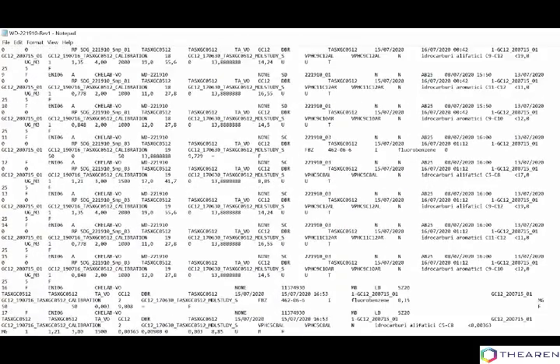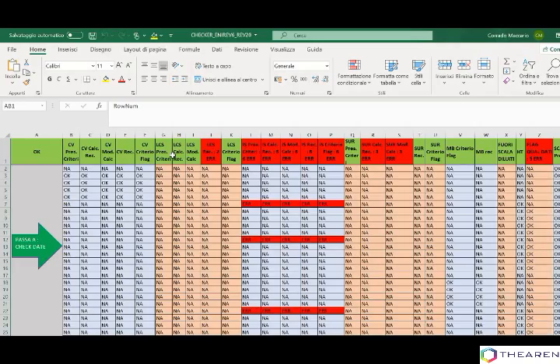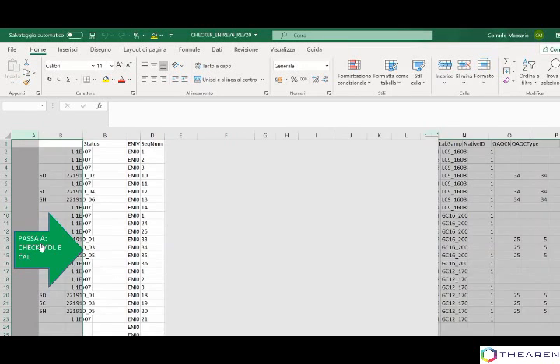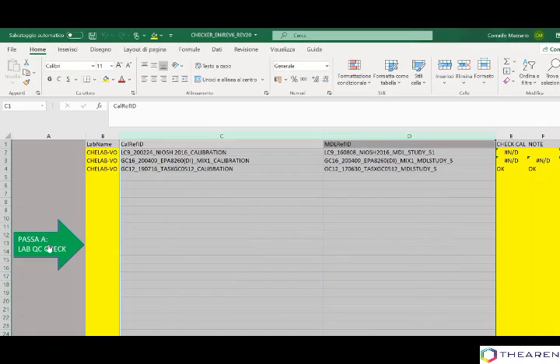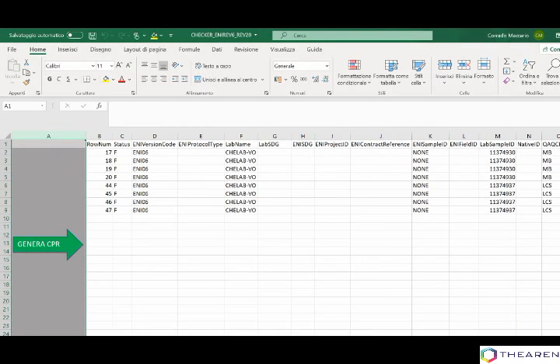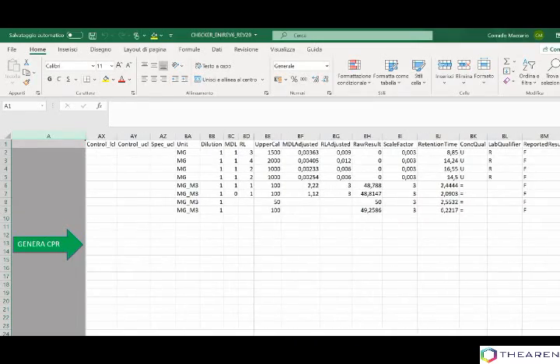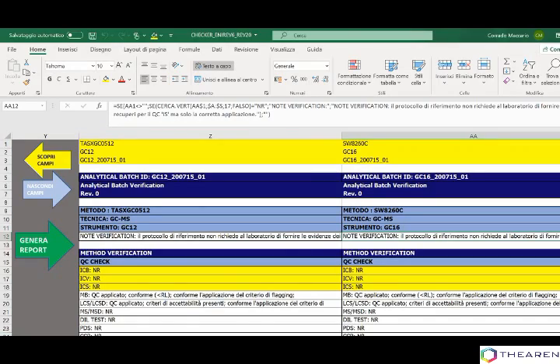Data verification and validation are an important step in the monitoring process because they ensure the quality of the data associated with monitoring with flux chambers. Thearen examines the quality data of the laboratory analysis by checking the correct execution of the QCs through an automated system and knowledge of environmental chemistry.